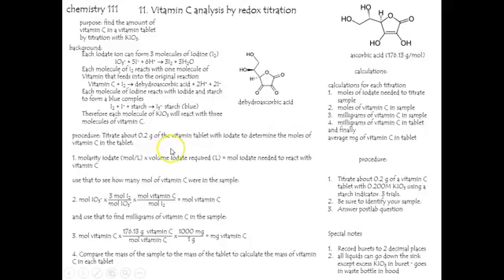And here's the relevant calculations. First, once you do this titration, the main thing you'll end up with is the milliliters of iodate that it needed to turn blue.